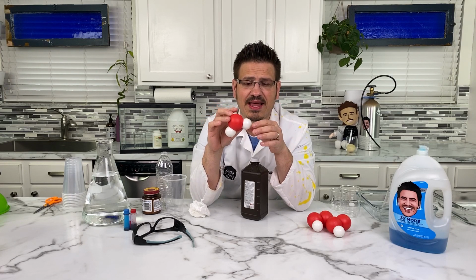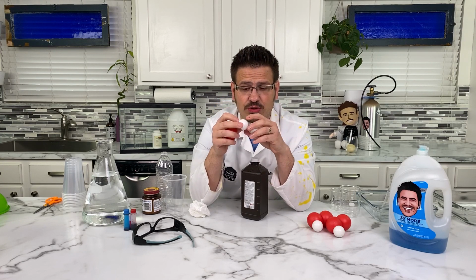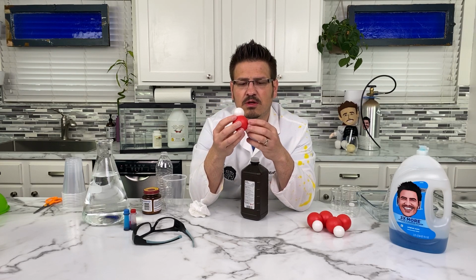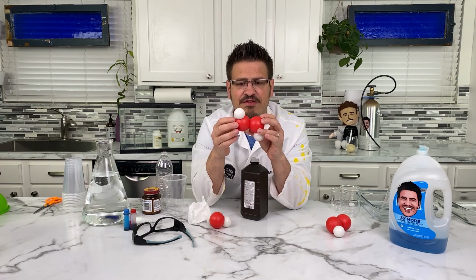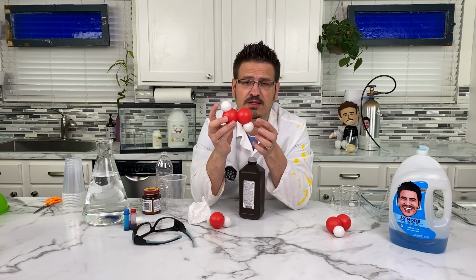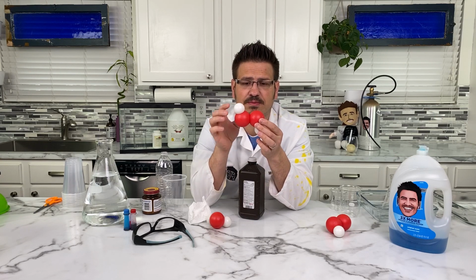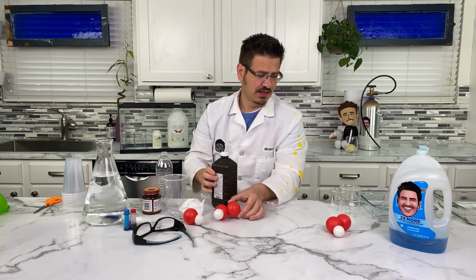H2O2. And when I say H2, we have hydrogen atoms. We have two of them, H2O. That's water. And here we have hydrogen peroxide. H2, two hydrogens, O2, two oxygen atoms. All right? And so what we have here is this liquid.